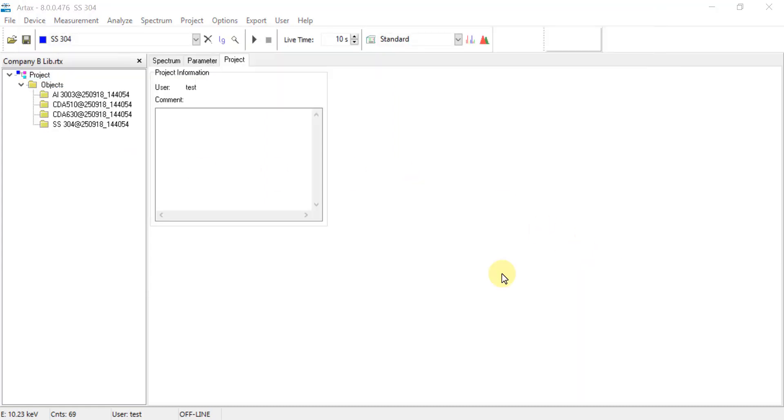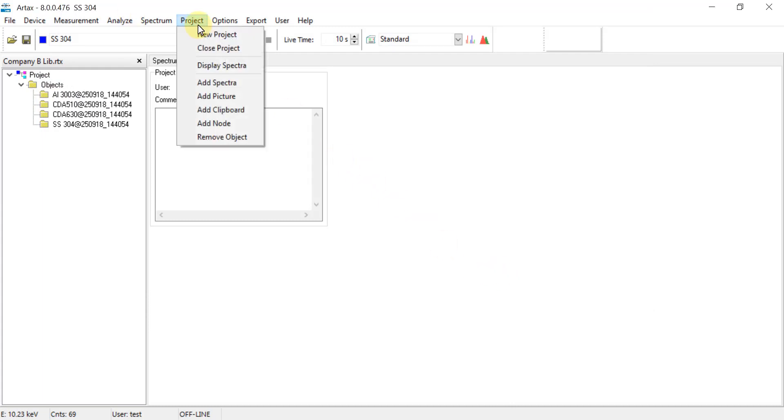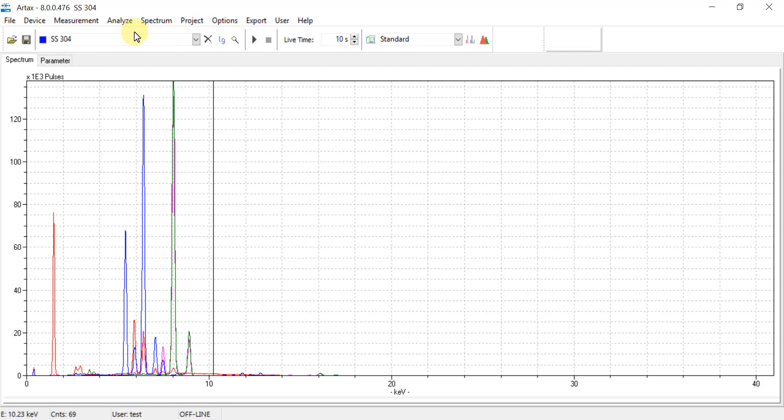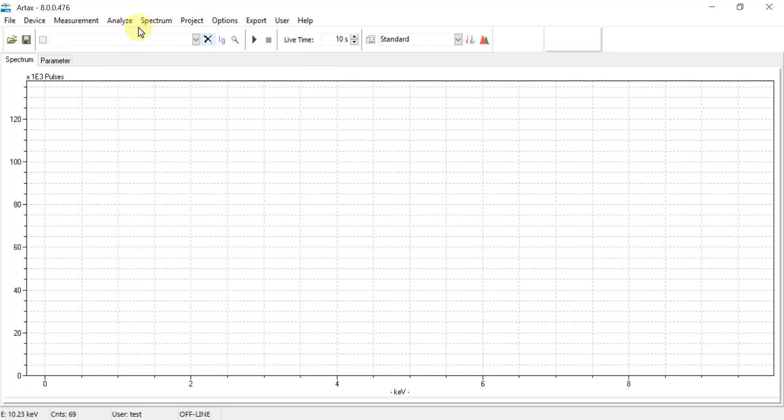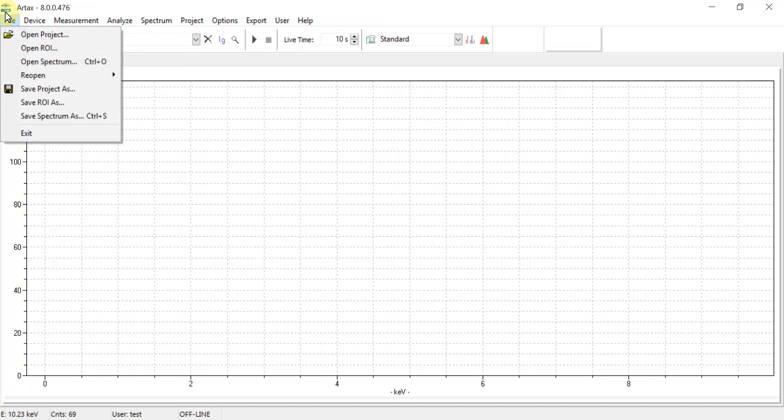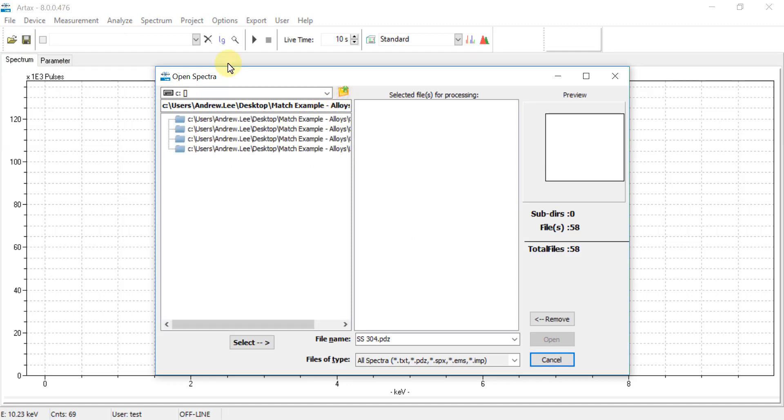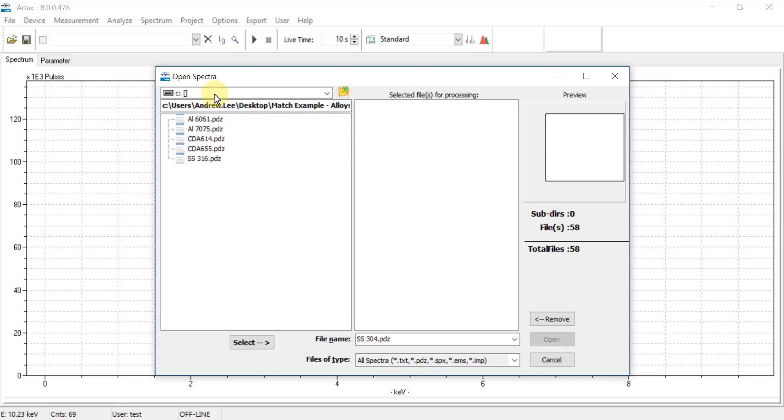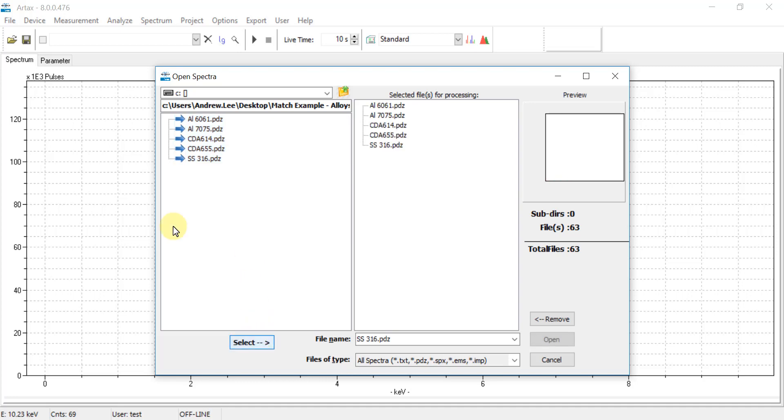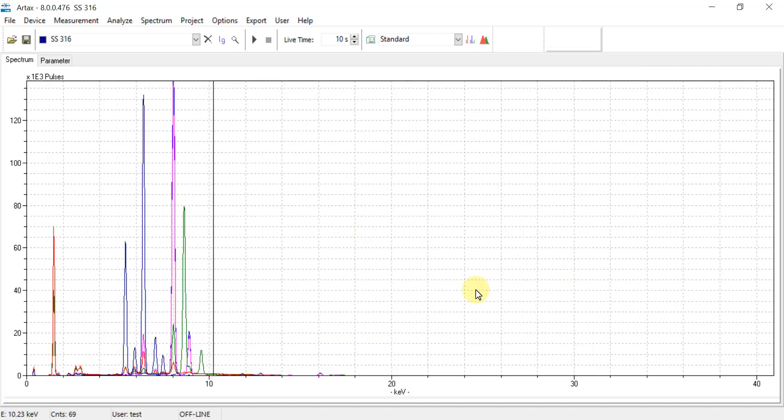And lastly we will repeat this for company C. So go back up to Project, Close Project, close out previous spectra. Now go back to File, Open Spectrum, and then navigate to the third folder, so company C. Click on PDZ, highlight the relevant PDZ files, hit Select, and then Open.